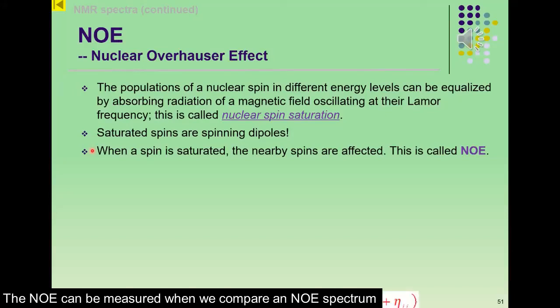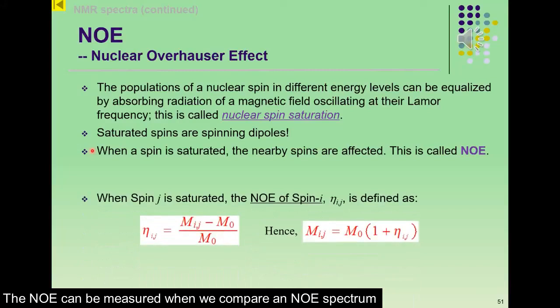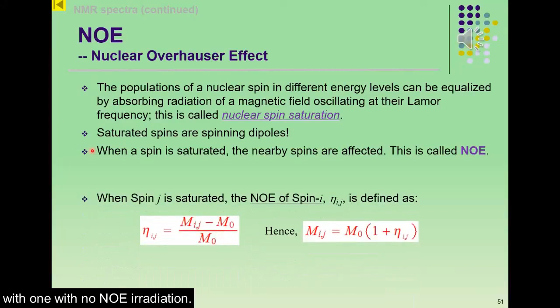The NOE can be measured when we compare an NOE spectrum with one with no NOE irradiation.